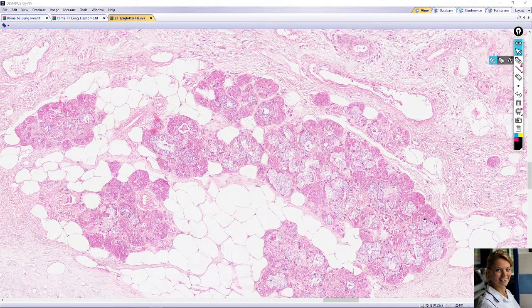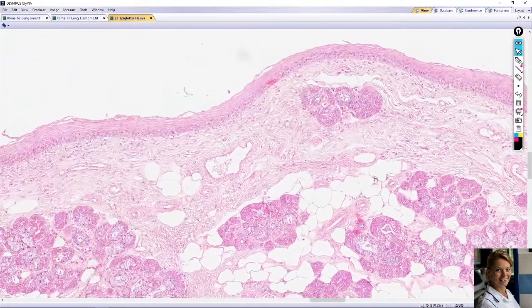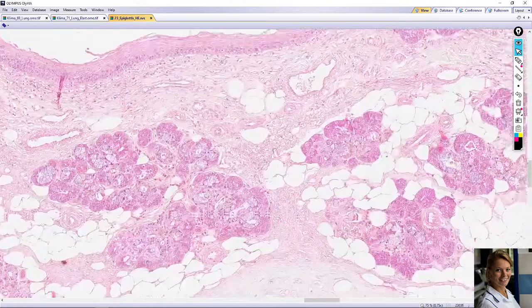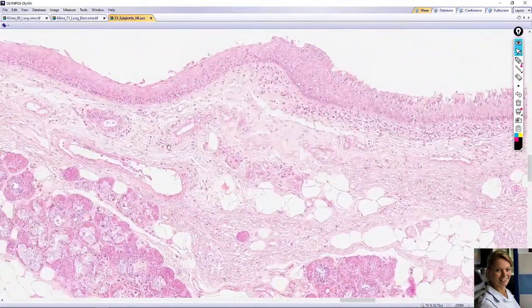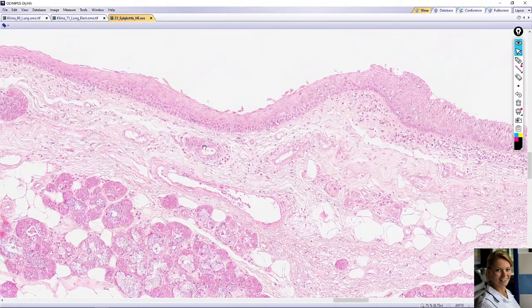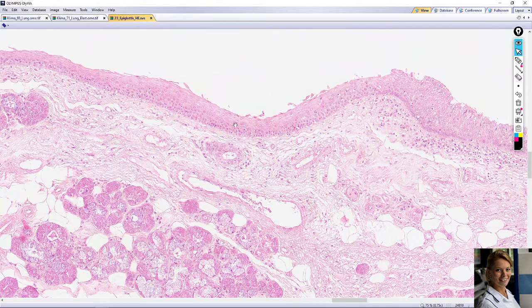This is a small duct, and here is a bigger duct lined by simple columnar epithelium. You can see the duct goes through the lamina propria and opens onto the surface of the epiglottis.